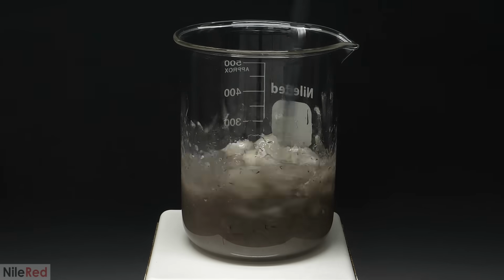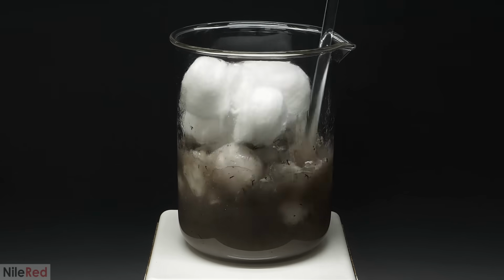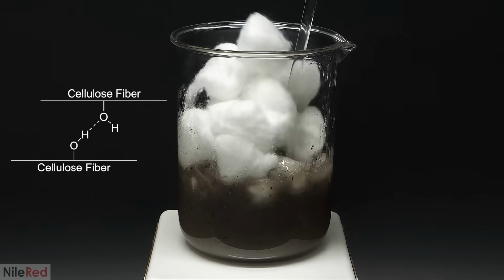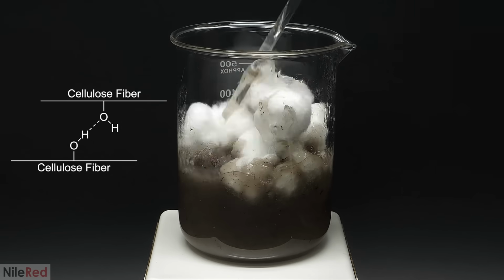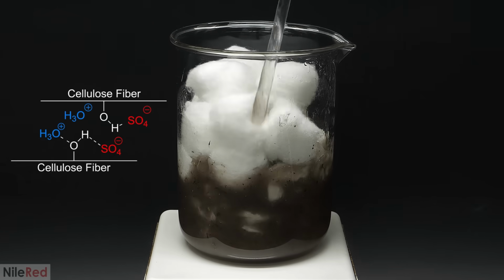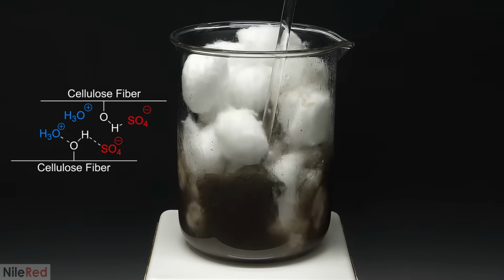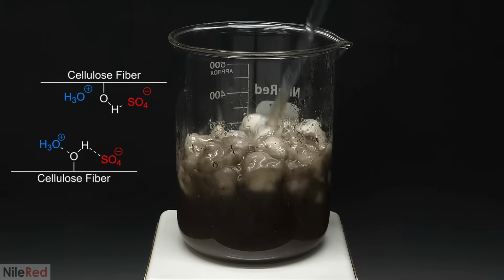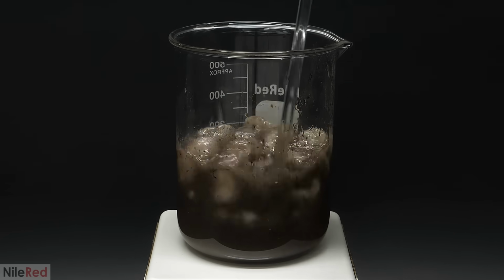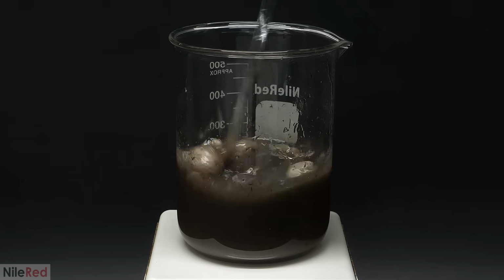Now, as far as I know, there was no major reaction going on here, and the cotton was just getting dissolved. I wasn't able to find much info about it, but it seems like the sulfuric acid was probably just interacting with the cellulose. It was forming a complex around their hydroxyl groups, which normally help the fibers stay tightly packed together. This was causing them to separate and fall apart and dissolve into the acid. It really didn't seem like it was going to work, but I was able to fit the whole bag.